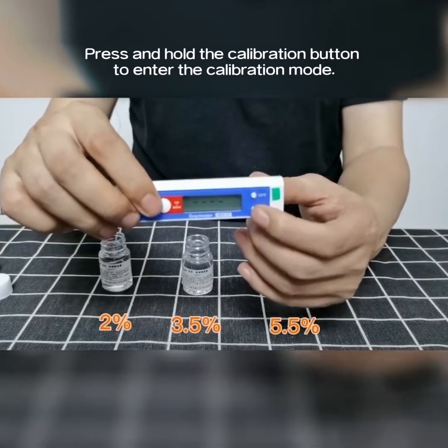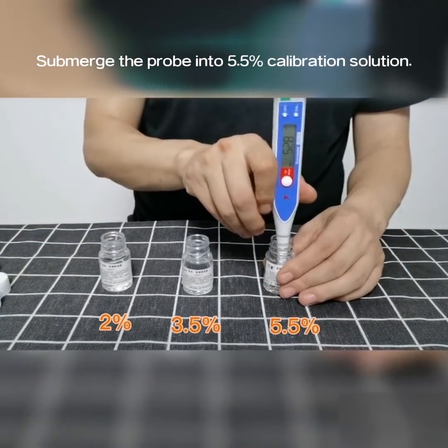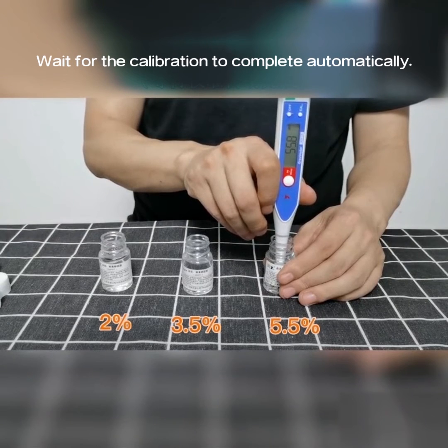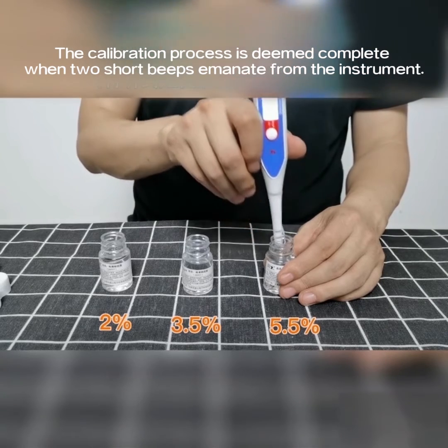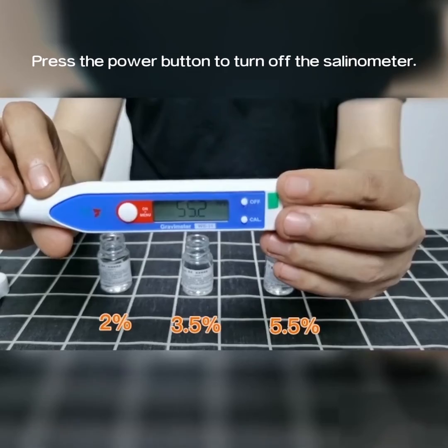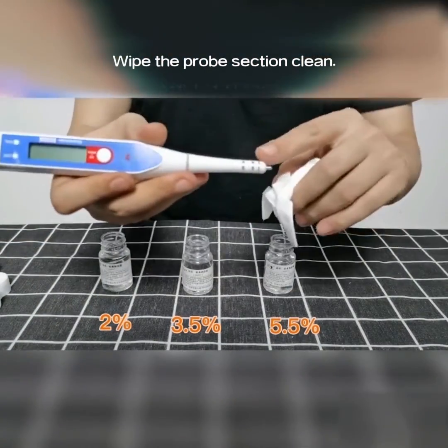Power on the selenometer. Press and hold the calibration button to enter the calibration mode. Submerge the probe into the 5.5% calibration solution. Wait for the calibration to complete automatically. The calibration process is deemed complete when two short beeps emanate from the instrument. Press the power button to turn off the selenometer. Wipe the probe section clean.